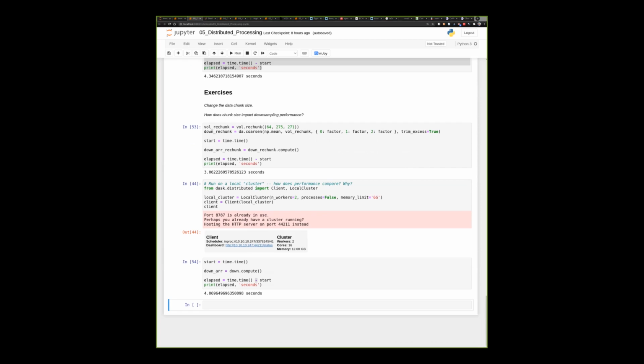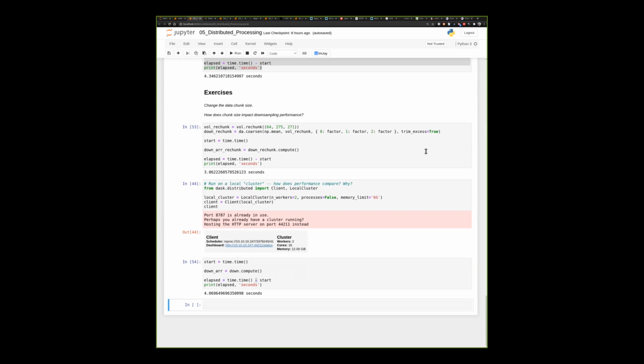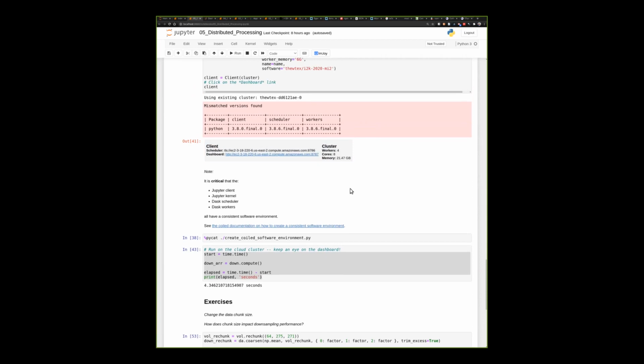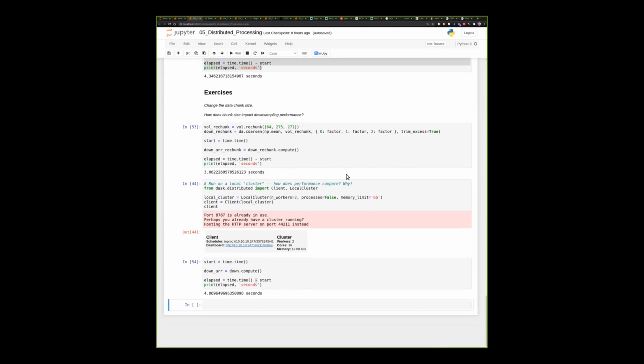Any other results? I had the same results. It took 28 seconds to compute it locally on my machine, 14 seconds using the cloud, and 18 seconds using the local cluster. Wow, that's really interesting. My results were quite different. I get much faster results locally. Any other experiences?